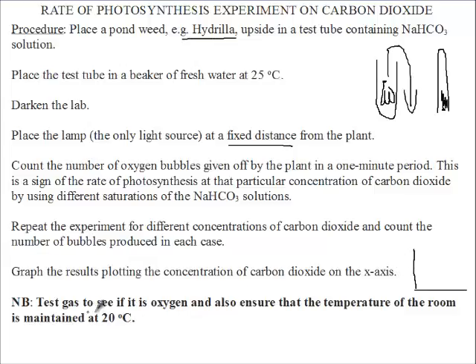In the end, we are going to test to see if the gas produced is oxygen. We test oxygen by seeing if it will relight a glowing splint, and then we make sure we keep the temperature of the room at 20 degrees Celsius.